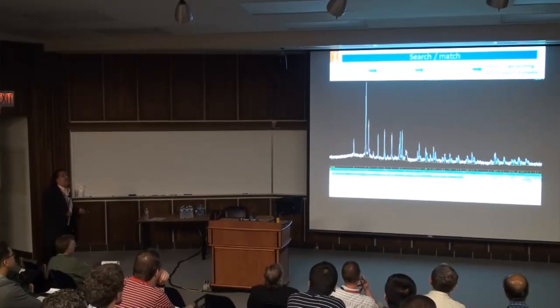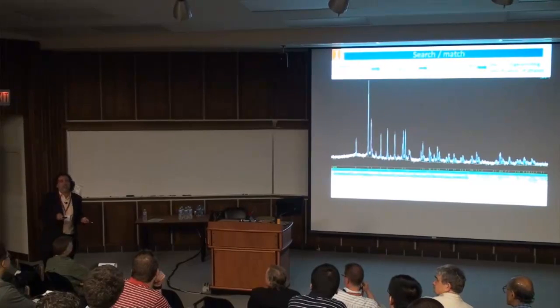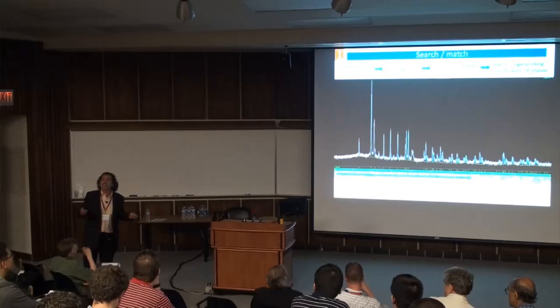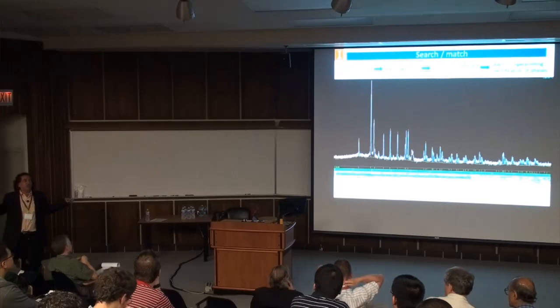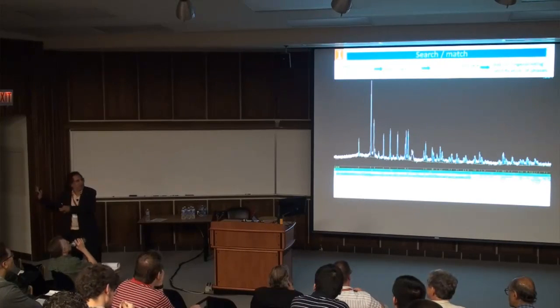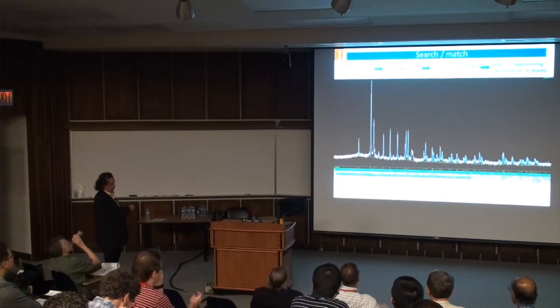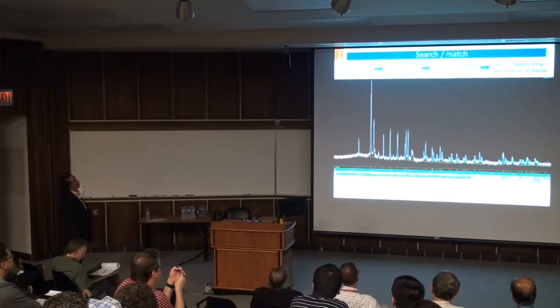When you do that, in the old times, maybe very old times, people used to do this manually. Nowadays, with 500,000 cards in the database, try to do that. Maybe if your kid is very messy and making a mess, you can give the kid a job to keep you in peace, doing a search match manually. But nowadays, or if you have a naughty student, you actually do that with the computer.